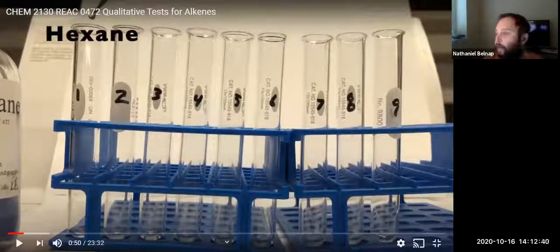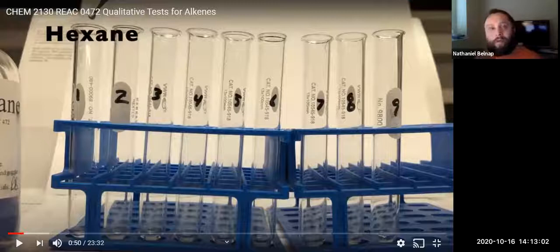So before we get started, I wanted to go through some safety precautions with certain chemicals that are being used in this lab. They're also listed in your lab manual, but I wanted to bring those to your attention. I know that we're not actually in lab, but because this is really the only time we're going to get this kind of exposure to this, it's just good to reiterate these things for each lab, so that way it stays more fresh in your head.